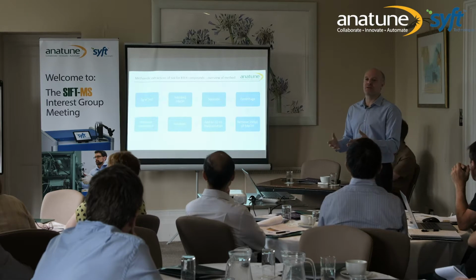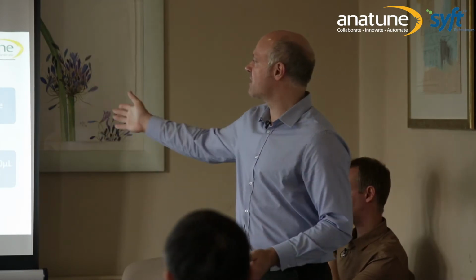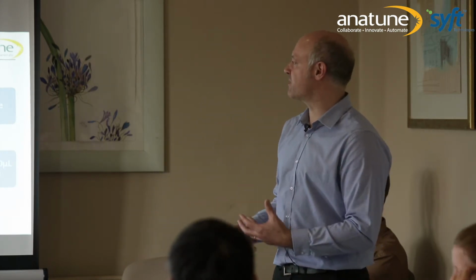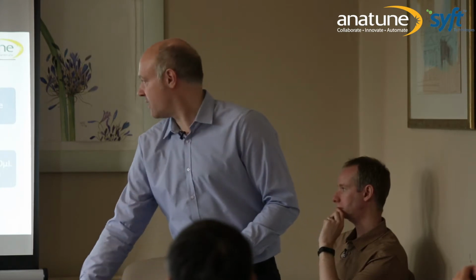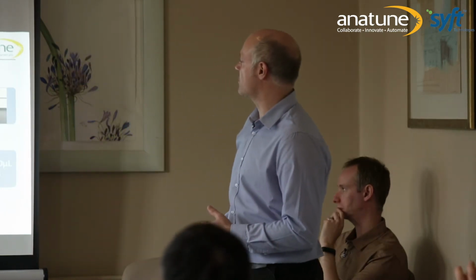And there are many ways of doing this. One method approach to do BTEX compounds in soil is a methanolic extraction approach. And this basically is how you do a methanolic extraction method for BTEX determination. So you take some soil, you add 6 mLs of methanol to it in a headspace vial, and you sonicate it to extract the BTEX compounds, and then you centrifuge it to pull the soil to the bottom, and you end up with your methanolic extraction at the top.